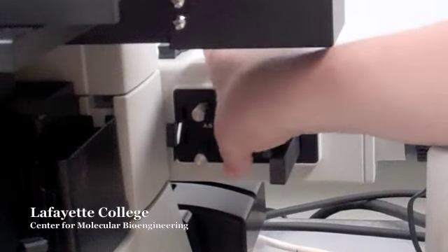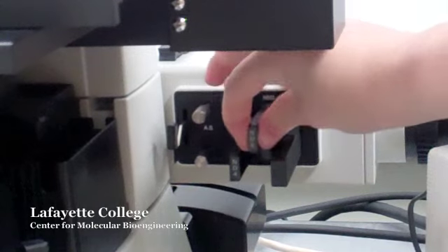Additional neutral density filters can also be found to the right of the microscope. Slide these filters inward to decrease the light intensity.